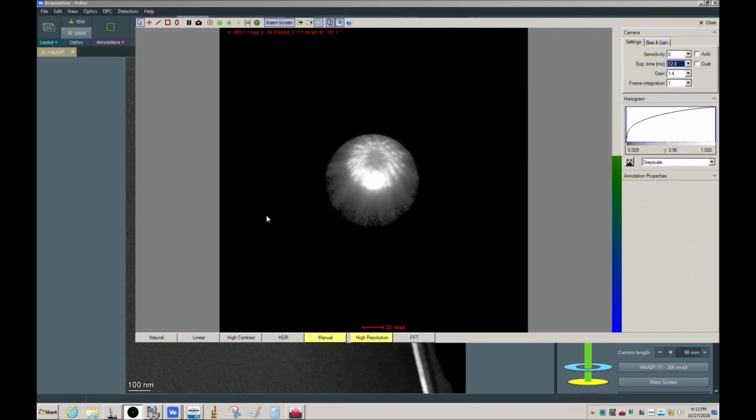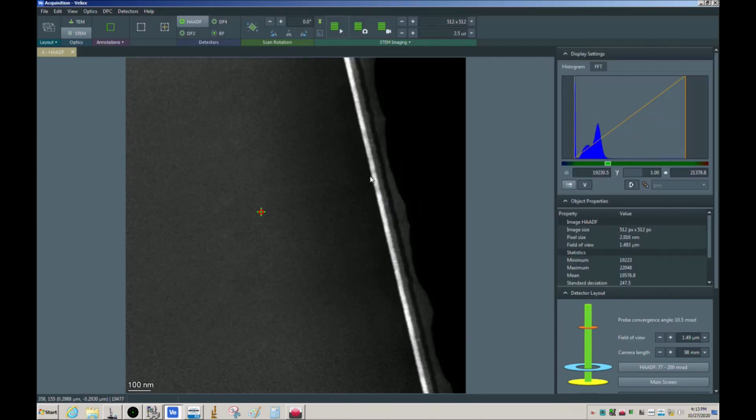So you see spots are curving up. That means I'd have to tilt beta in the negative direction. So I tilt beta in the negative direction, my spots curve down. So that means I have to tilt beta in the positive direction. This is exactly what we saw with the tilt map in the conventional image. So it's no different in STEM. The only difference is that now you have a CBED pattern as opposed to a conventional pattern.